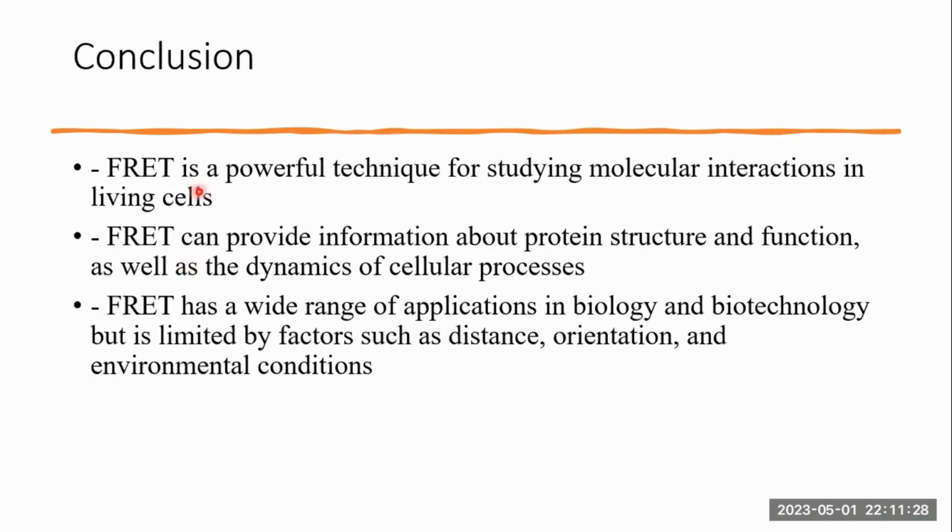In conclusion, FRET is a powerful technique for studying molecular interactions in living cells. It can be used in a variety of ways to study protein-protein interactions, even protein-lipid interactions and nucleic acids. It's very useful in our field. It has a wide range of applications.